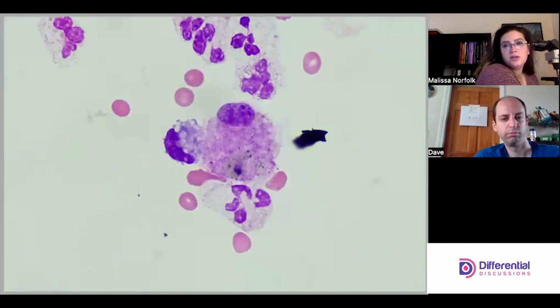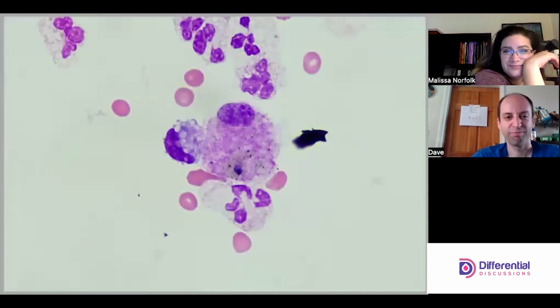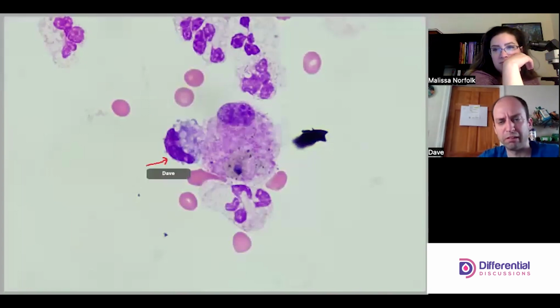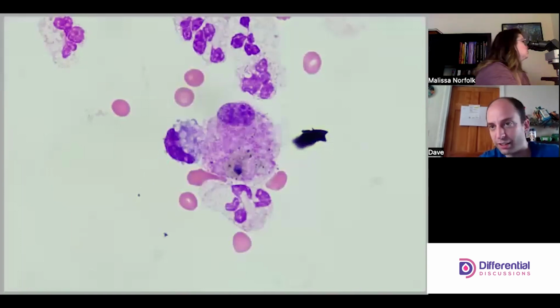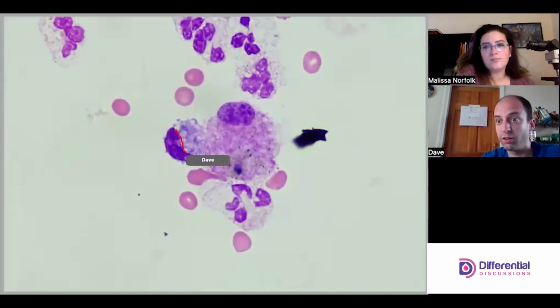So with these big, ugly, junky cells, how come they aren't malignant? I'll definitely admit that some of these, like this fella right here, are not the greatest looking cell. But when I start to test it, one of the things I really like to look for in malignant cells is the nuclear contour. If I trace this nucleus, I don't see anything that's too troubling. Every time I see a point where it indents, there's a vacuole there, so there's a physical thing pushing on it.